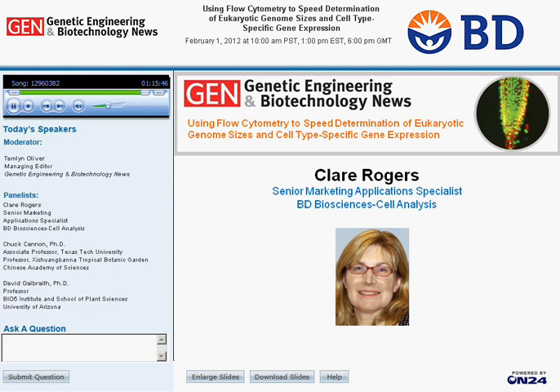All right, Claire, I have another question for you. Are the Accuri list mode data files FCS 2.0 or FCS 3.0 standard file format? They're FCS 3.0 only.